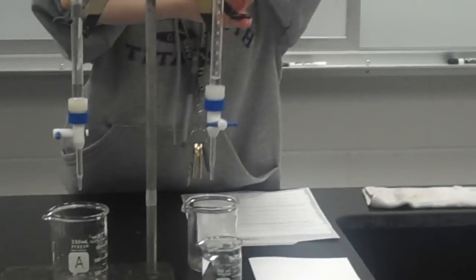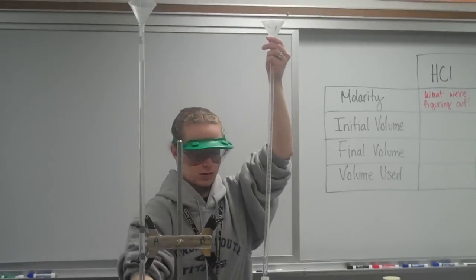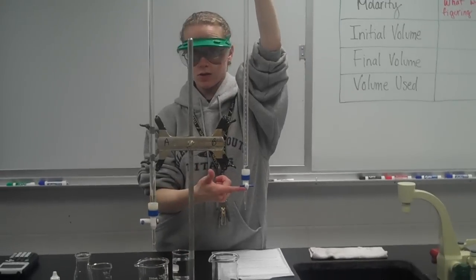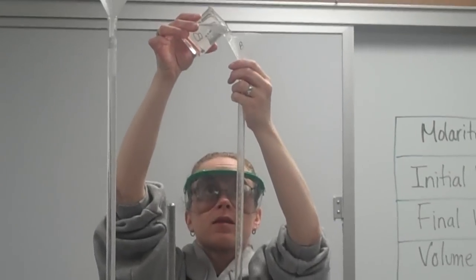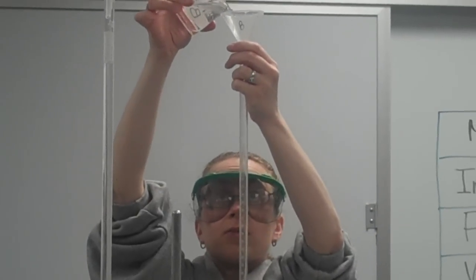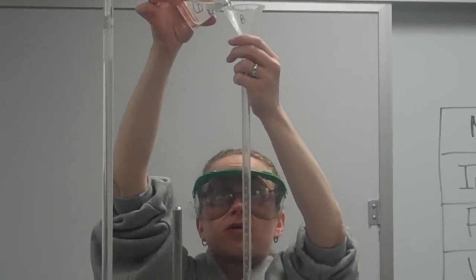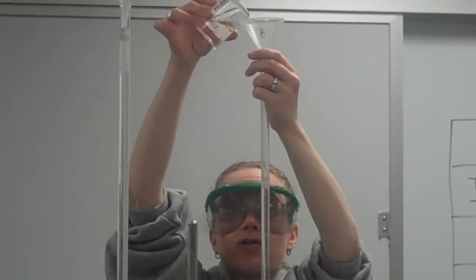Take it off the stand. Make sure that the valve is closed. Pour the base into it. It can be tough not to splash, but I'll be careful. Another reason why I'm wearing goggles, because I might splash. Oop, there, see?